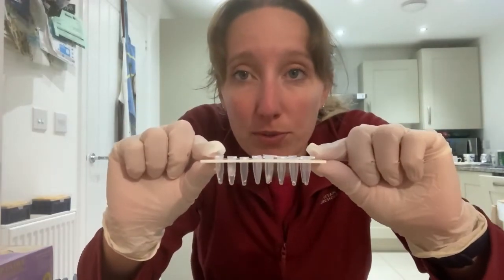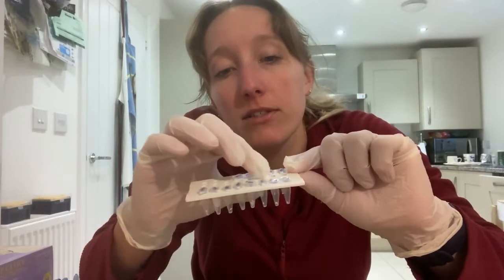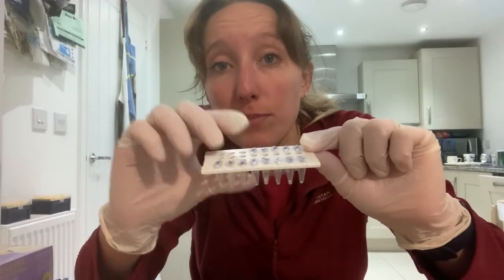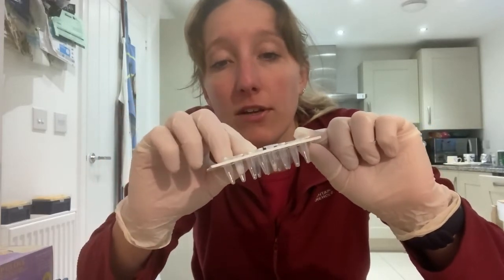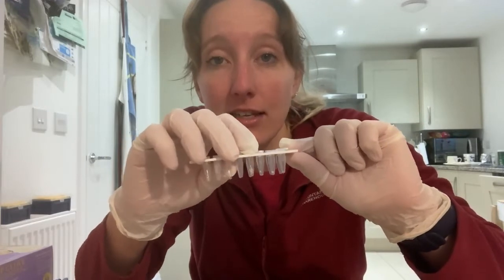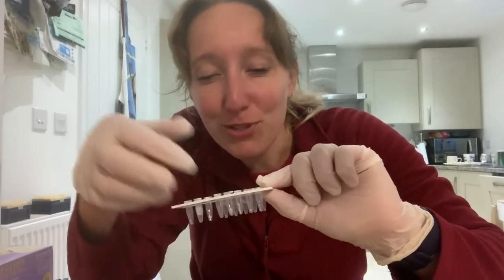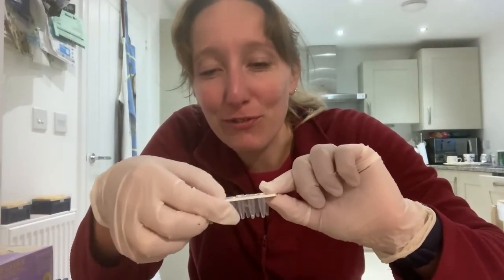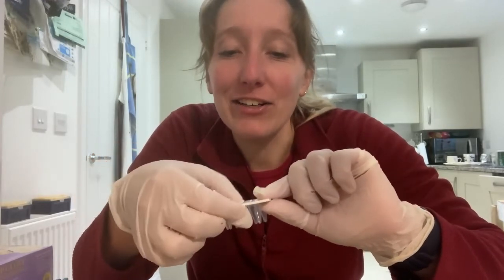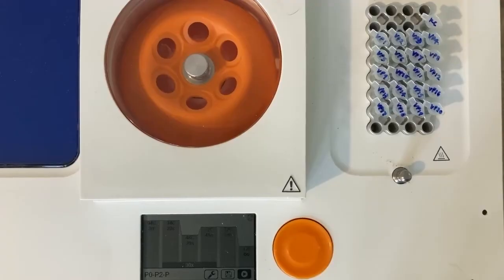I've finished cutting up the feathers and they're already in the PCR tubes for the hot shot DNA extraction. The next step is to add the alkaline lysis buffer to each of the tubes, then put them on the Bento Lab heat block at 95°C for 20 minutes, then add the neutralizing buffer. I've shown you all this before on a previous vlog so I won't go through it again — I'll give you a quick overview and come back when it's time to set up the PCR.